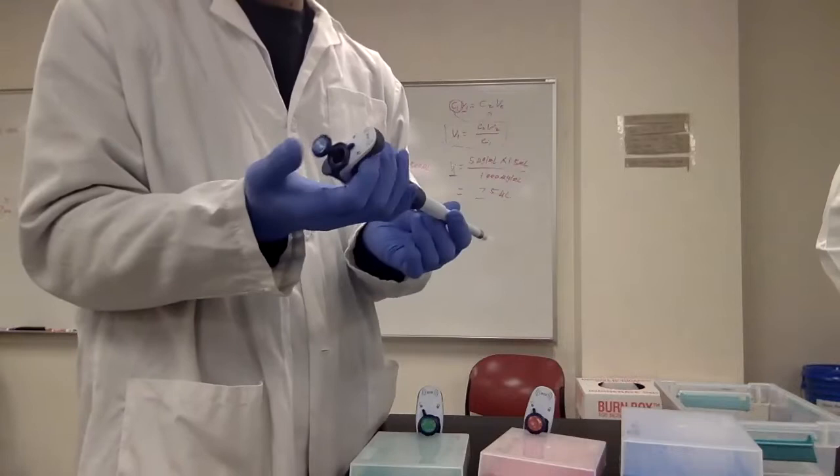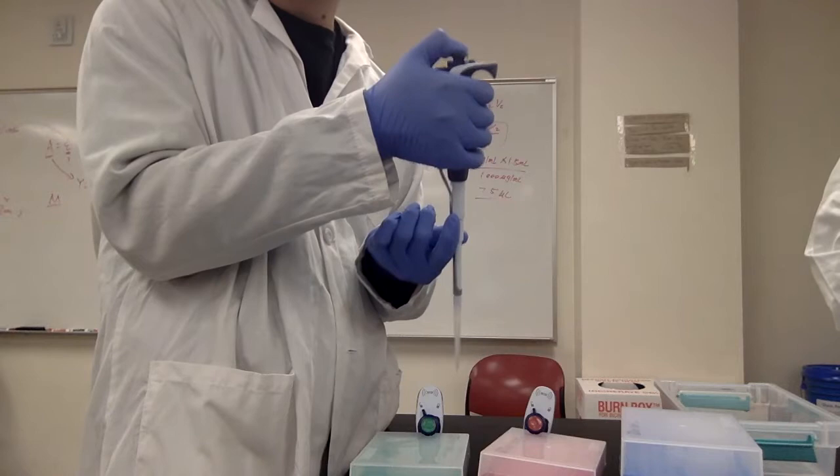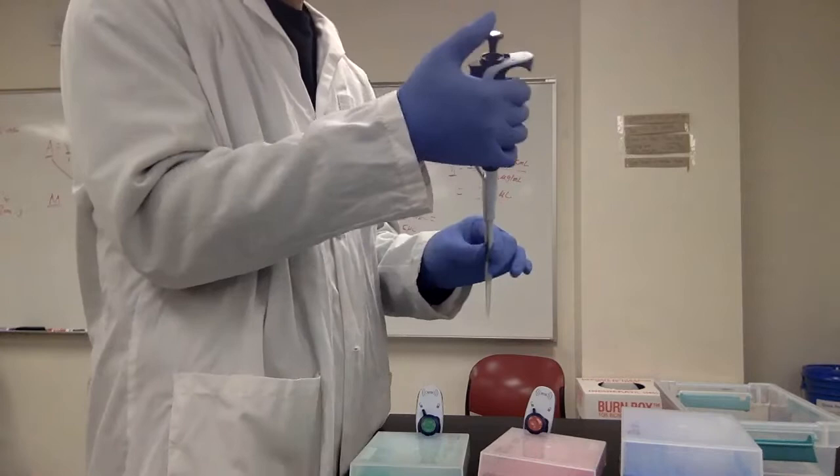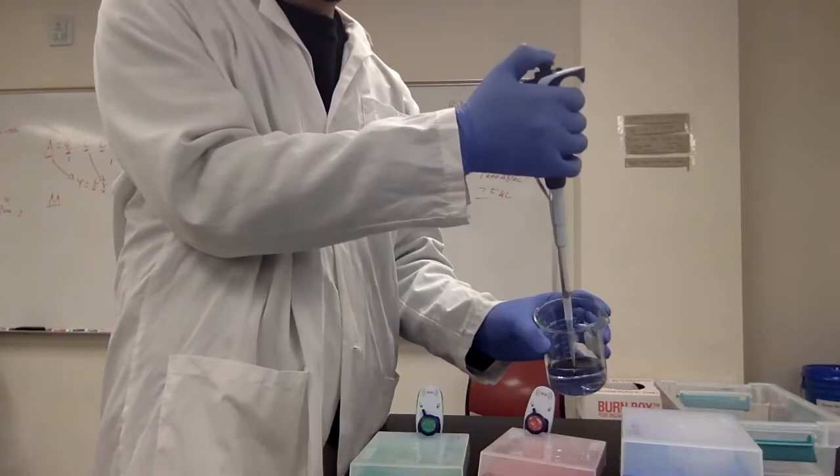And after that, you push this plunger to the first stop. I'm not sure if you guys can see clearly. If you push further, you can feel the second stop. But when you're pipetting, connect with the tip, push it to the first stop, and dip your pipette tip into the liquid, then release the plunger slowly.